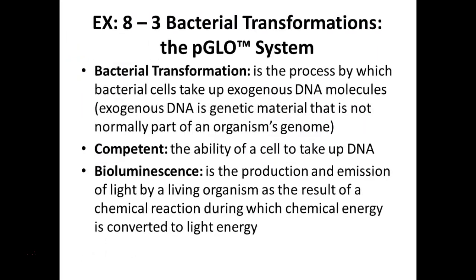To make sure that your system is working. So what's transformation? It's a process by which bacteria cells take up, if we're talking about bacterial transformation, exogenous DNA molecules, so outside the cell, and bring it in. Competent means the ability of the cell to be able to take up the DNA, right? Not all cells are competent.